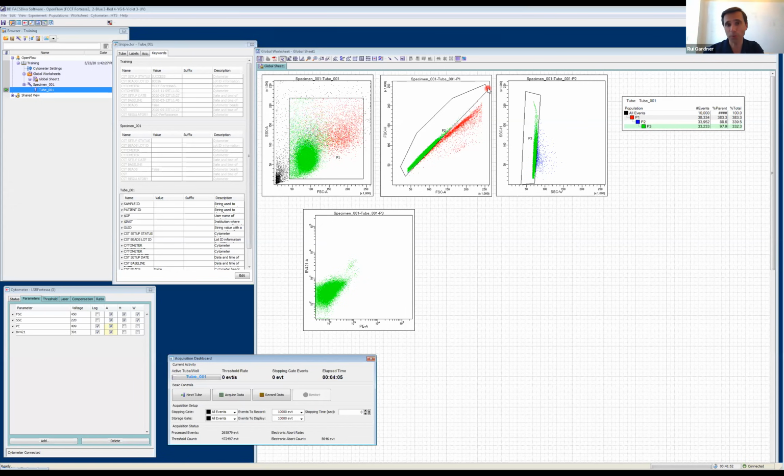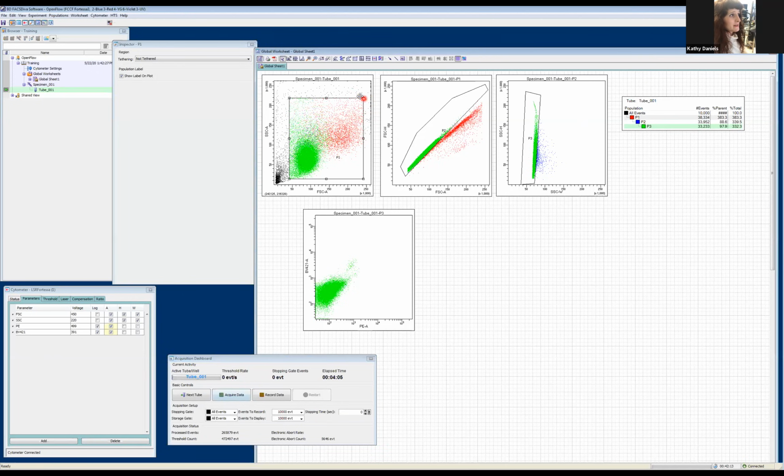But then there's another question in terms of the gating. Somebody's asking, you seem to have left out the monocytes when you selected the singlets, the population in red now. Is that correct? Yeah, so sometimes what you'll see is an exaggerated forward scatter profile of aggregates of cells. So if I went ahead and decreased this gate right here, oh, look, almost all are singlets, right? So you want to be mindful of how you set your gating.